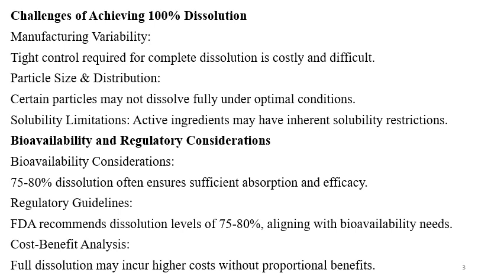Manufacturing variability: tight control is required for complete dissolution. It will be costly and it will be difficult. Particle size, that is PSD and distribution: certain particles may not dissolve fully under optimal conditions. Generally, the dissolution conditions should be mild, should not be very aggressive, so you are achieving the 100%. And 100% dissolution is not the goal.